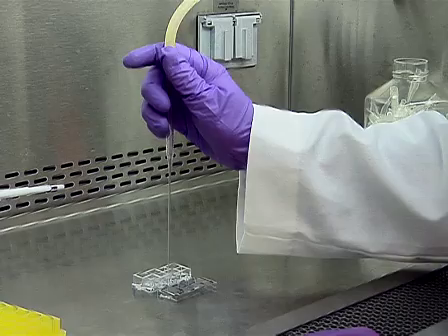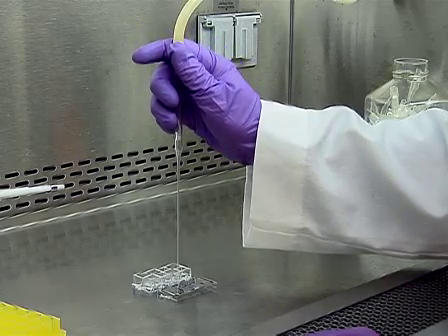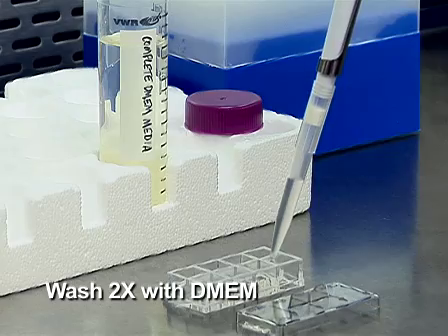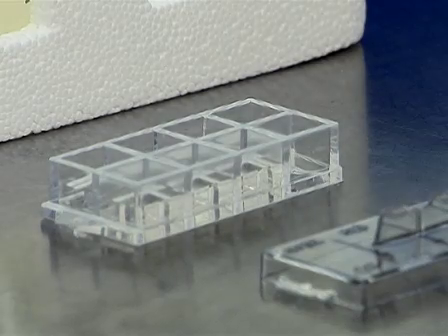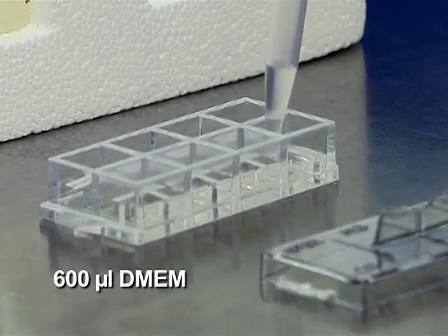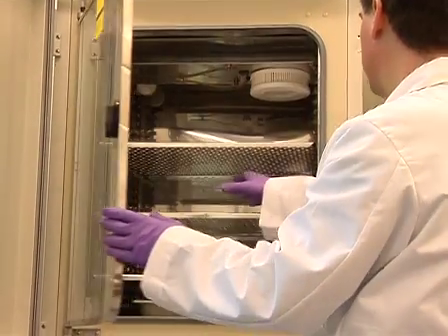Next, carefully remove the transfection complex media from each sample by vacuum suction. Wash cells twice with 600 microliters of complete DMEM, then replace the media in each well with 600 microliters of complete DMEM. Return the samples to the incubator.